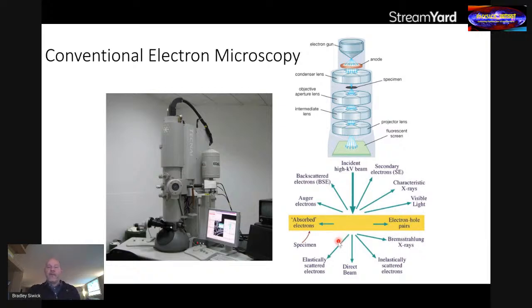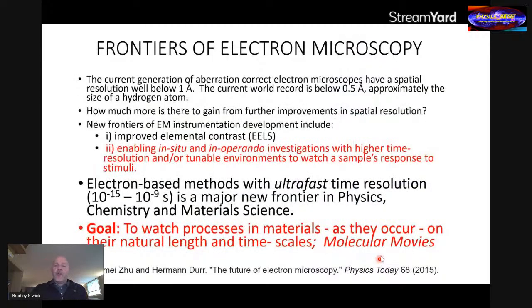They give you reliable information about the lattice spacing and atomic arrangements. And the inelastically scattered electrons tell you about the nature of the excitations that are present in the material. And so that's an enormous amount of information, which we hope to be able to build on. Okay, so as I said, electron microscopy is a mature field. A modern electron microscope is a remarkably capable instrument in the laboratory to do materials research.